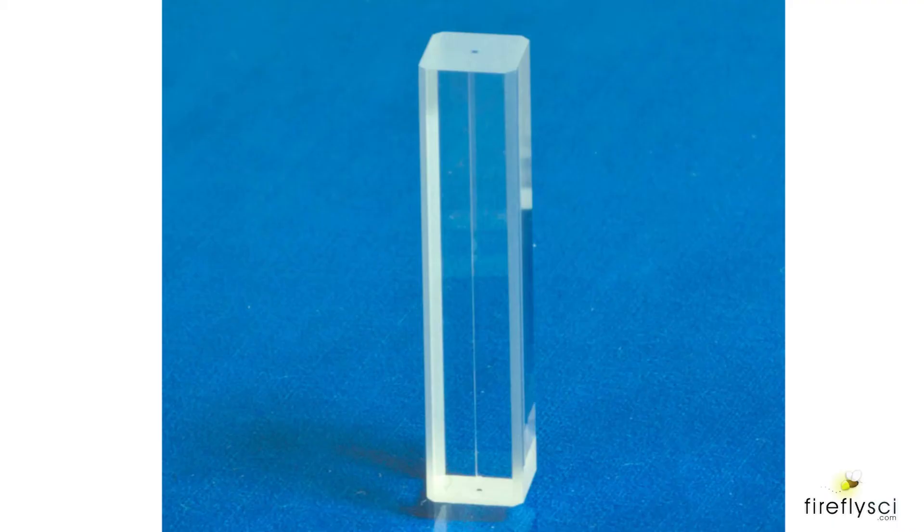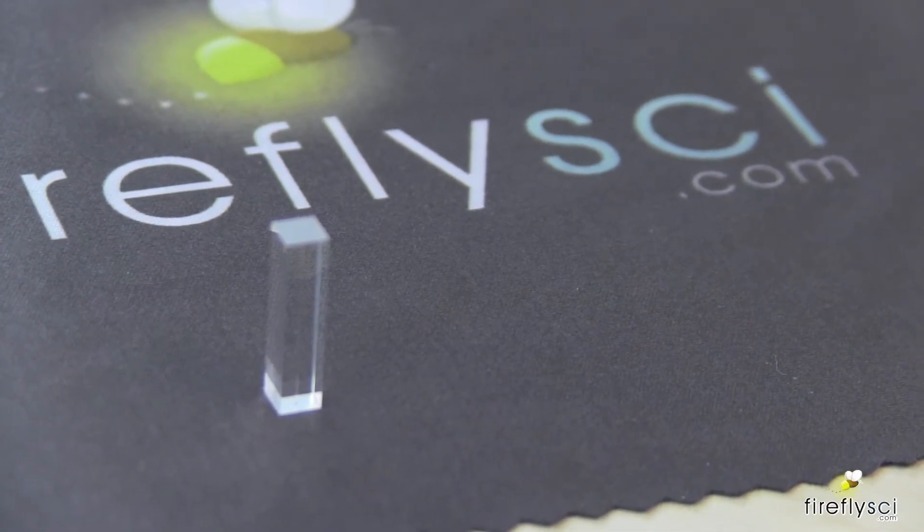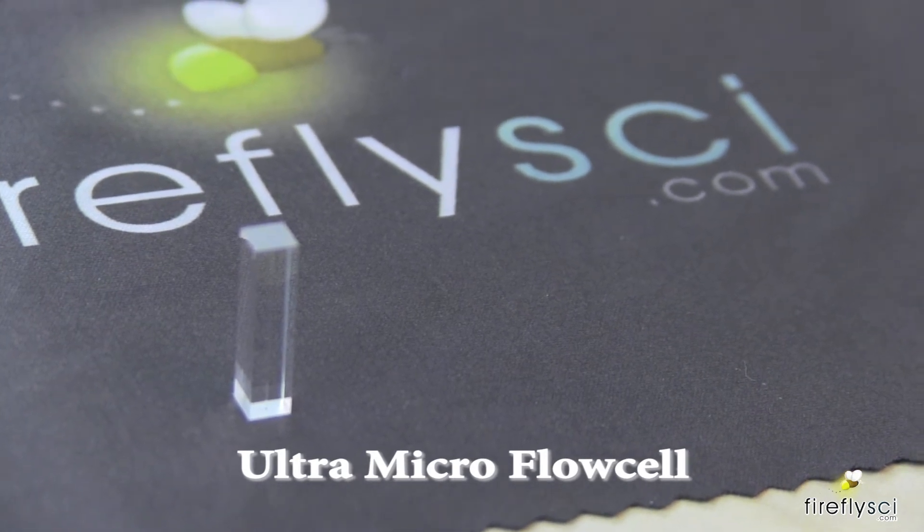The main focus of this video will be on these little flow cells that we manufacture. This flow cell is an ultra micro flow cell and the channel size ranges from 50 microns up to 1 to 2 millimeters.